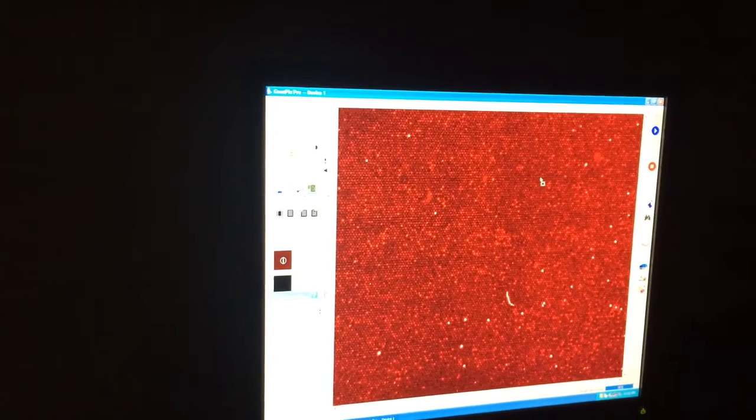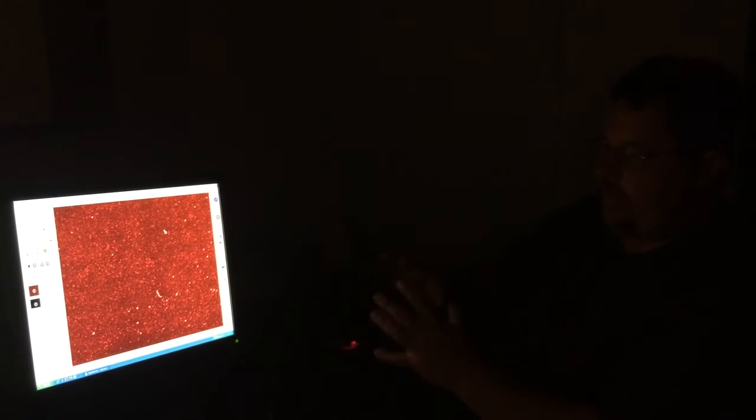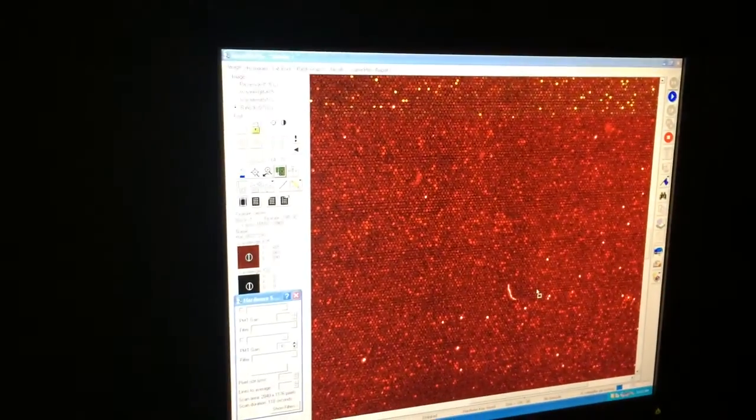Anyway, now you're seeing the more careful scan. And you can really see the spots now. The white spots represent features, because we call these spots or features. These are the actual individual genes. We call those features. And if they're white, that usually means that there's so much RNA there that's been labeled and it's saturated beyond the detector's limits, actually, at the high end. If you don't see a spot, it means it's not really being expressed at a level we can detect. And sometimes you see these little artifacts. That's actually just like maybe some fiber from clothing that's attached, or something, some dust and things of that nature.